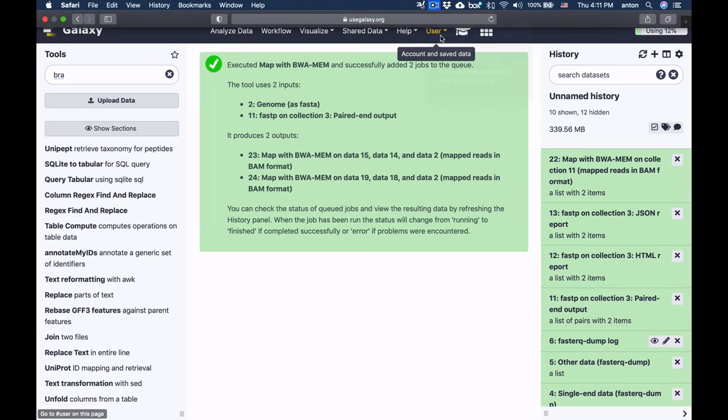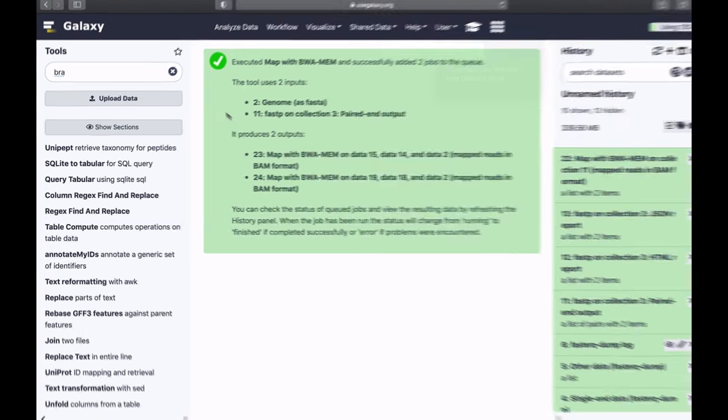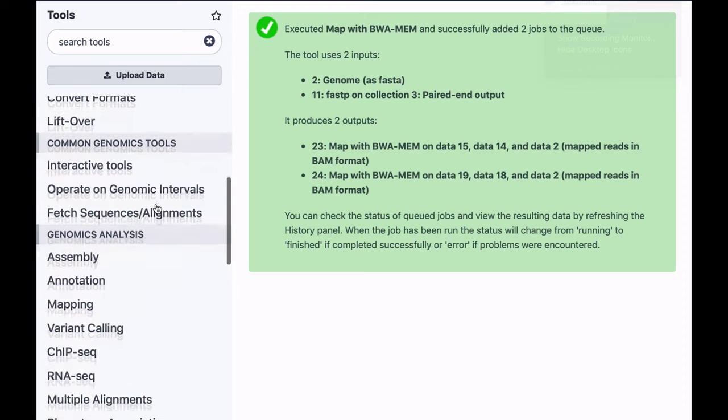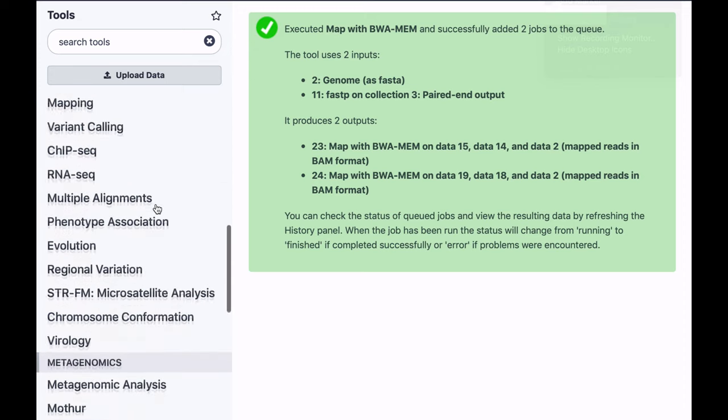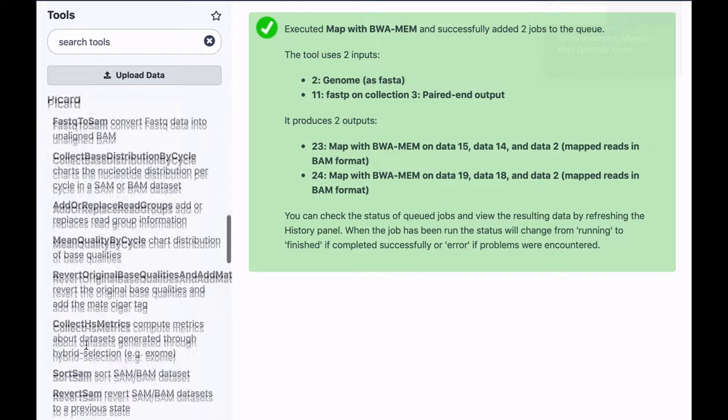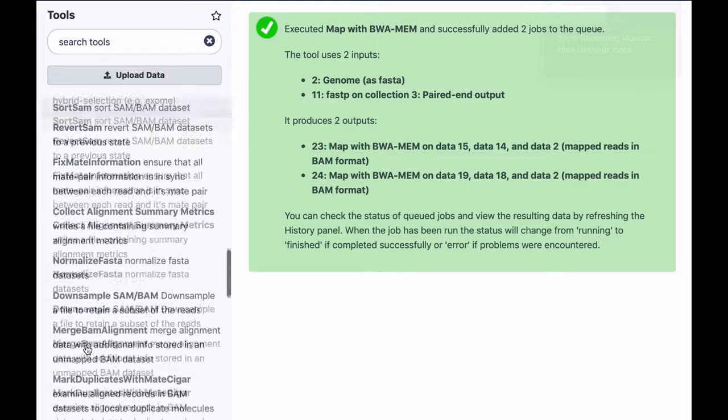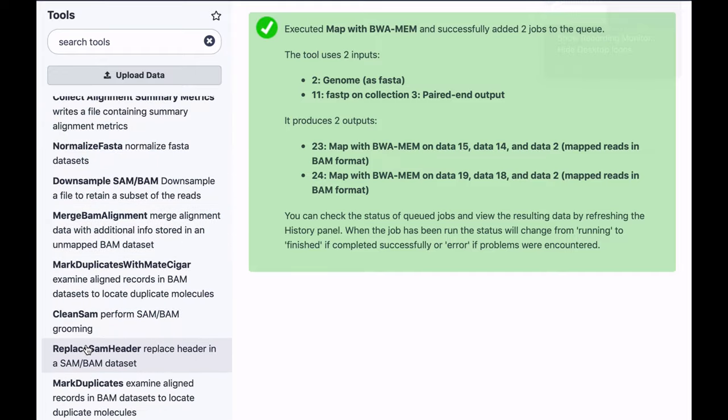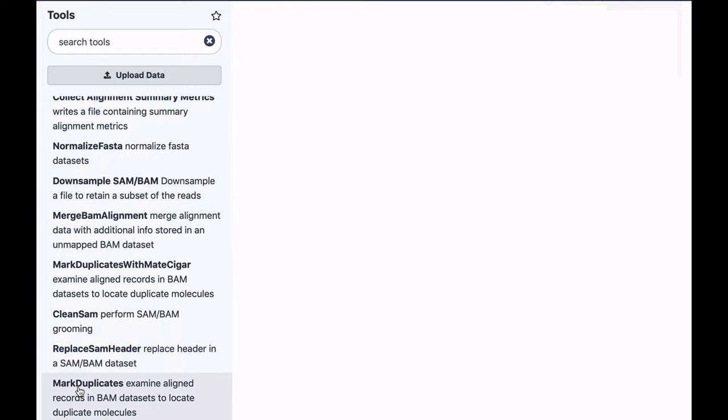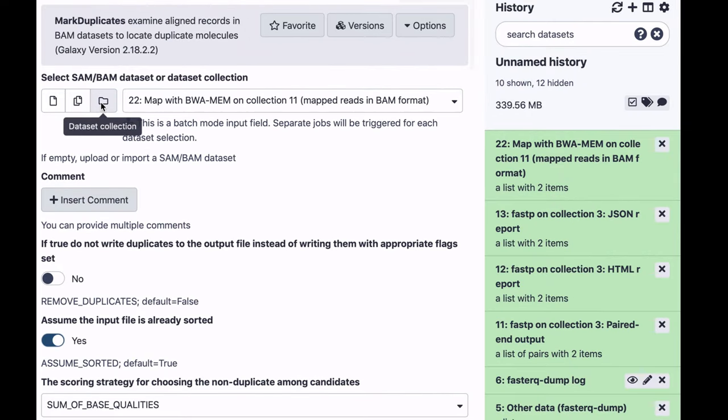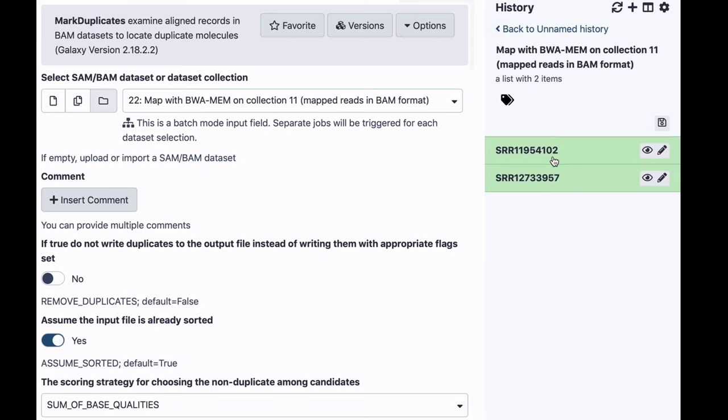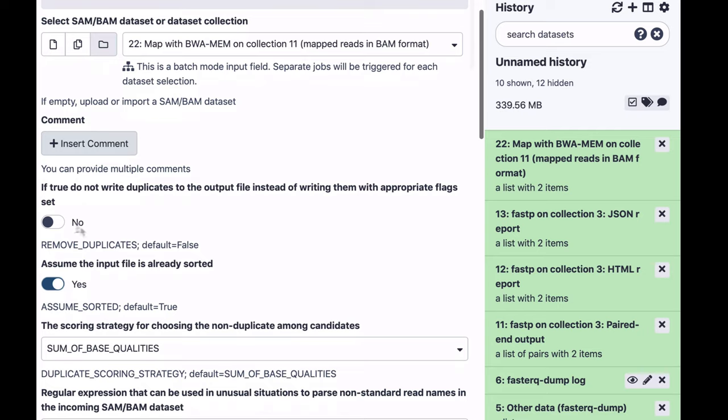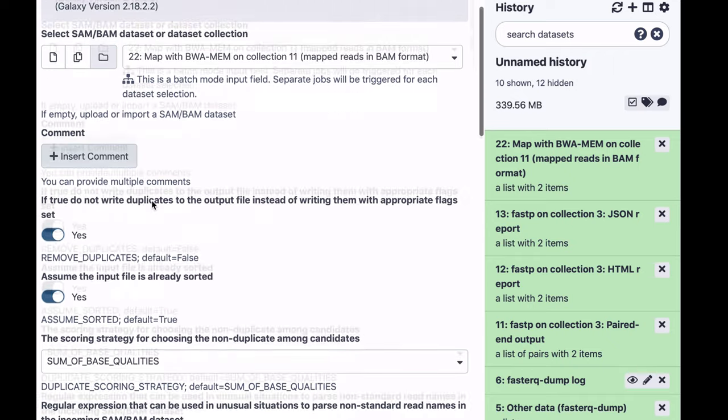Next, let's remove duplicates. The removal duplicates tool is a part of the Picard package, so we're going to select the mark duplicates tool. I'm going to use collection as an input, this time it's a collection produced by BWA-MEM, it contains two BAM files. And I'm going to switch this to yes, because I don't want duplicate reads to be included in the output.